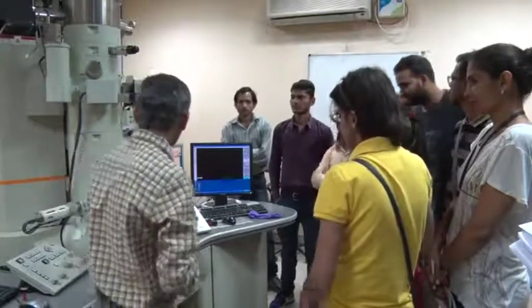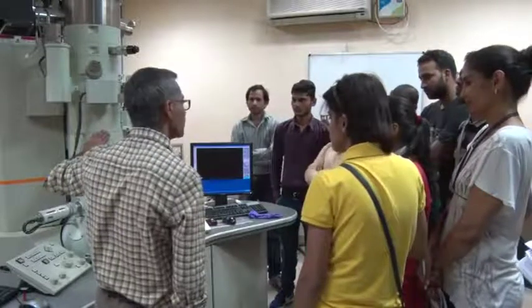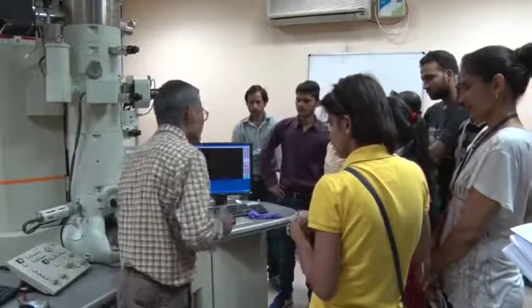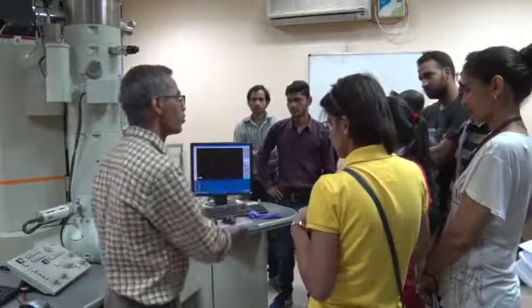Then we have diffraction focus, which is related to the diffraction lens current, or the power of the diffraction lens, and there are different modes. I was always telling that just by pressing one knob one goes from imaging mode to diffraction mode.